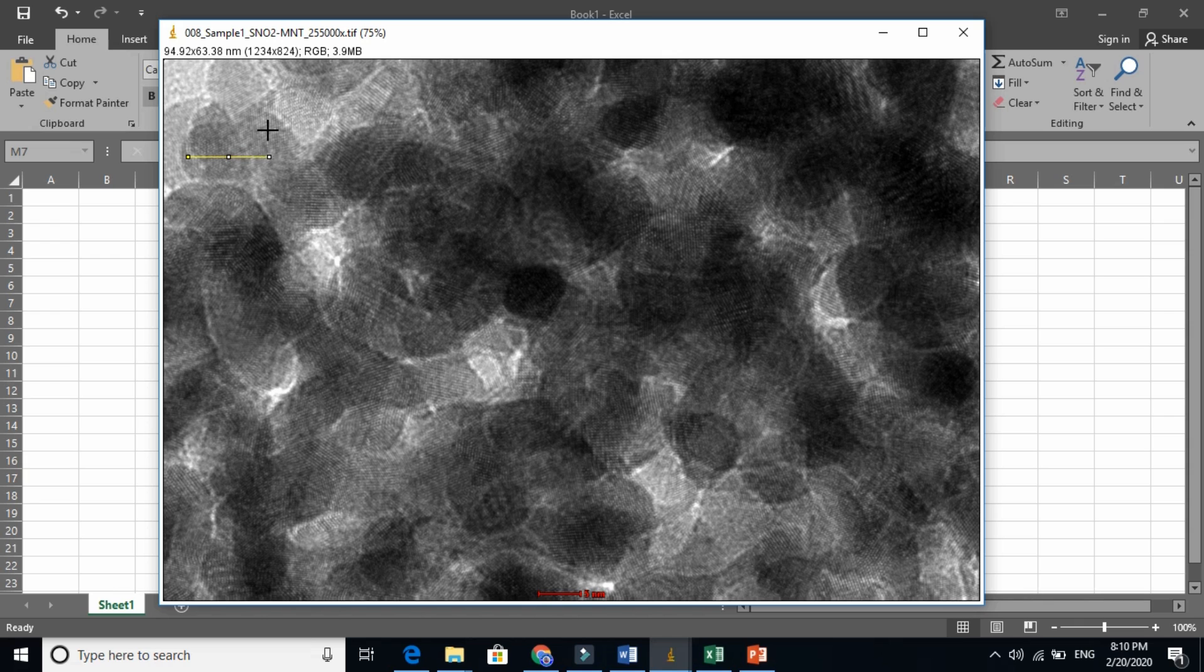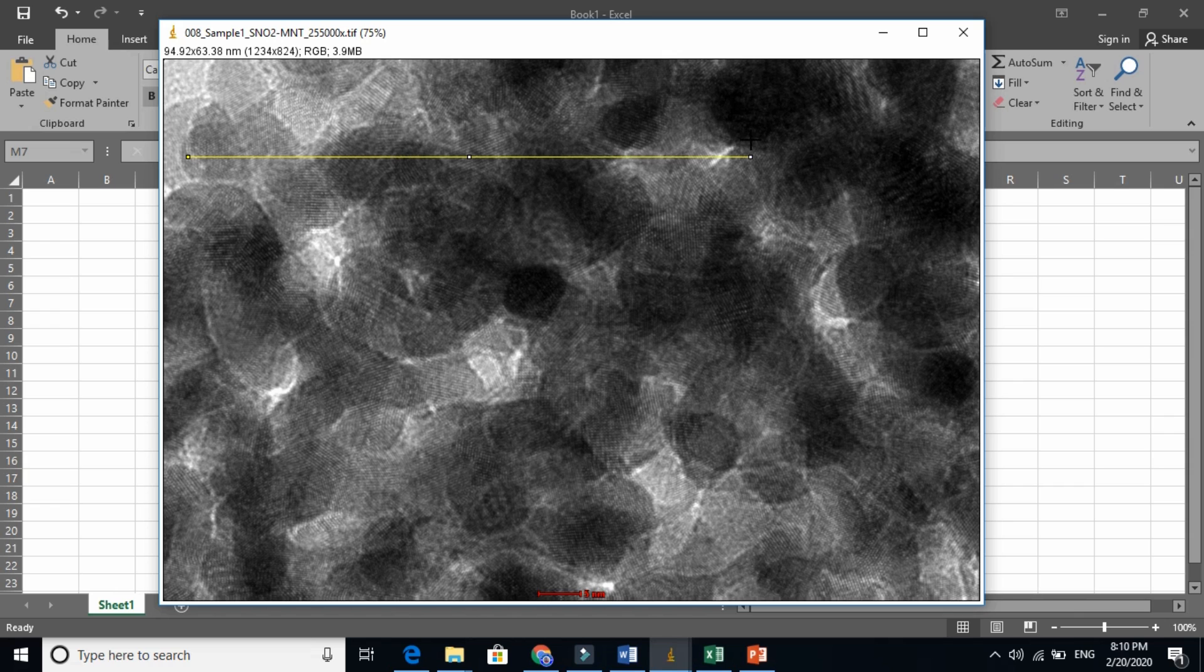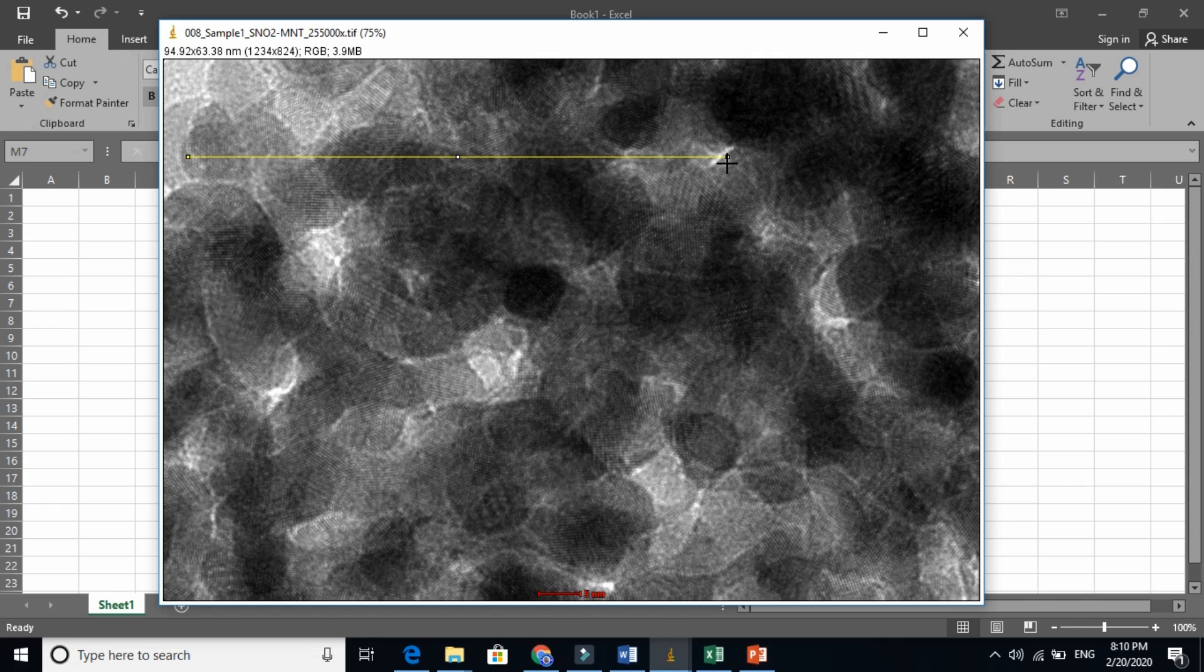Like this. And just press control M. So now the length of this whole grain. So just count the grain.